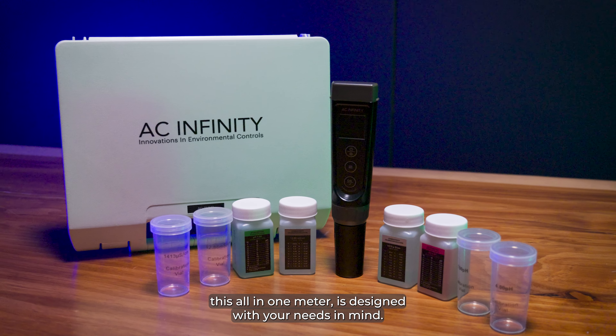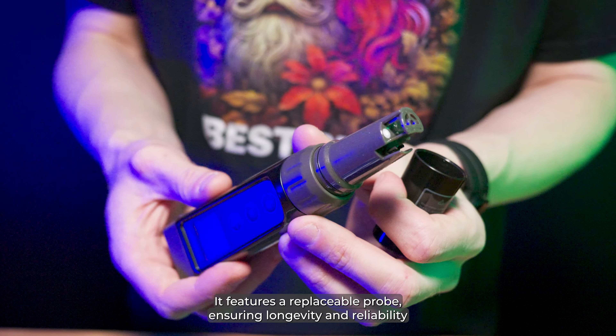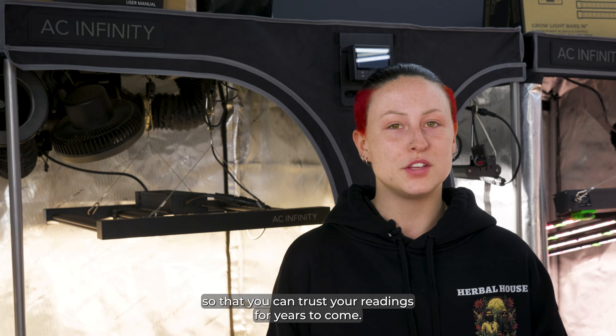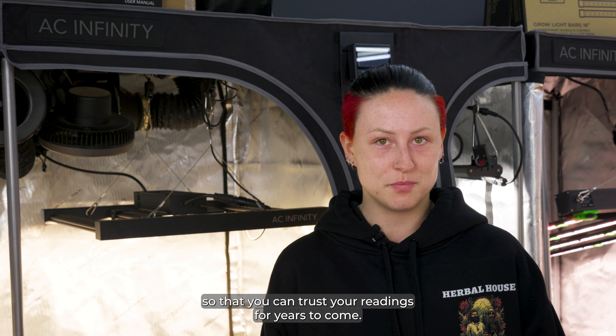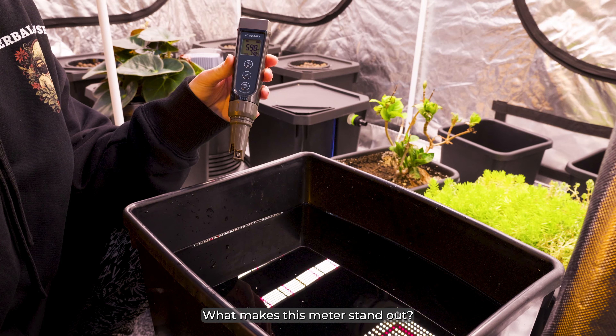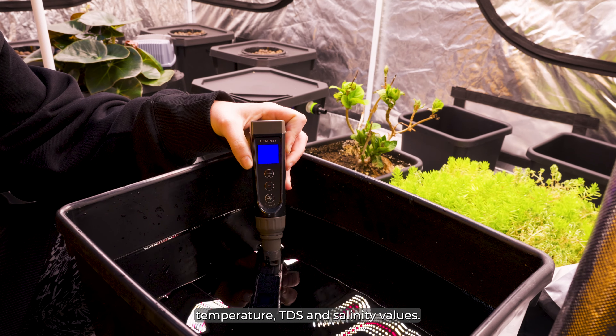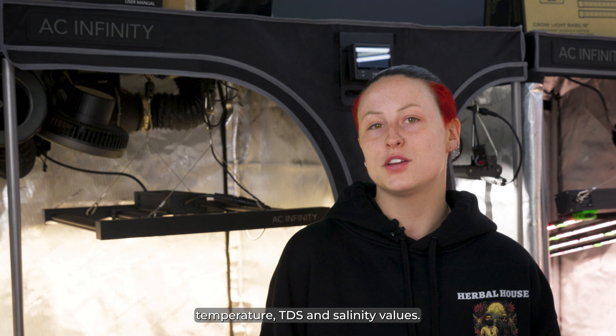This all-in-one meter is designed with your needs in mind. It features a replaceable probe, ensuring longevity and reliability so that you can trust your readings for years to come. No more worrying about whether your tools are up to the task. What makes this meter stand out? It measures not only pH and EC, but also temperature, TDS and salinity values.